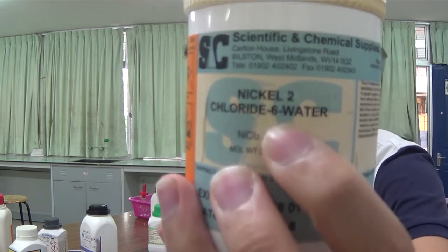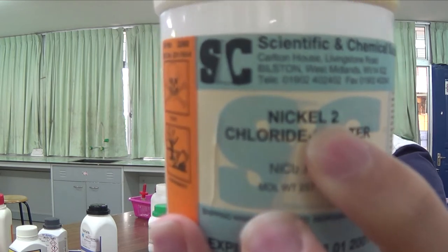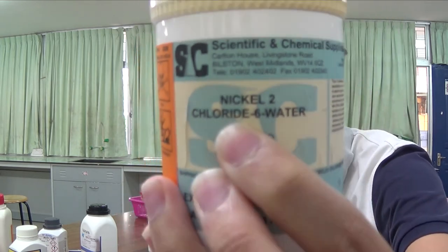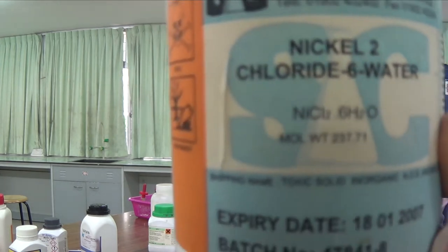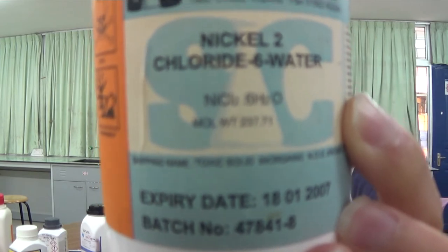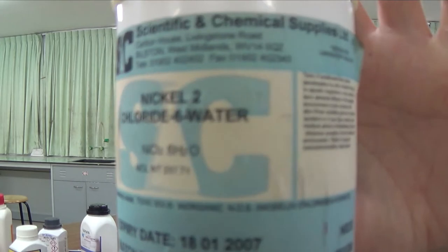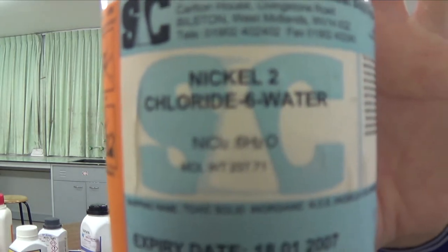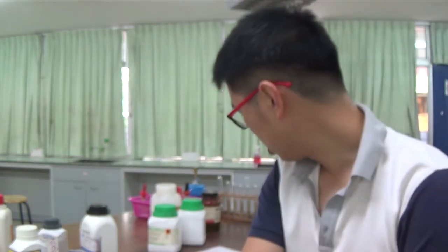This is nickel(II) chloride, so it's Ni2+ and Cl-, and this one is 6 water as well. So NiCl2.6H2O, okay? So you can work out the molecular mass. NiCl2.6H2O, the molecular weight is given there. Being a transition metal, again, nickel is just in between cobalt and copper.